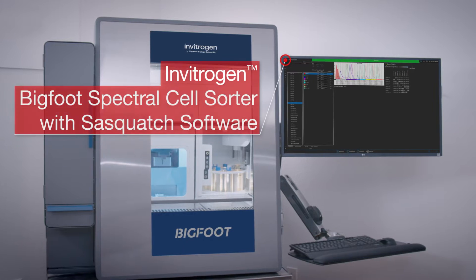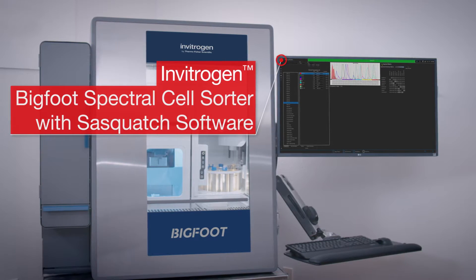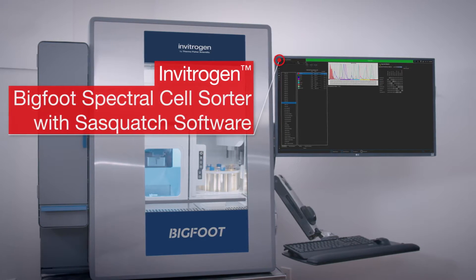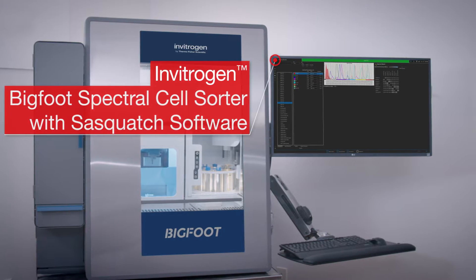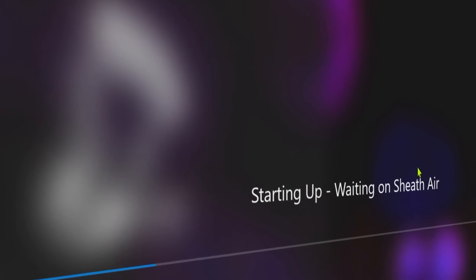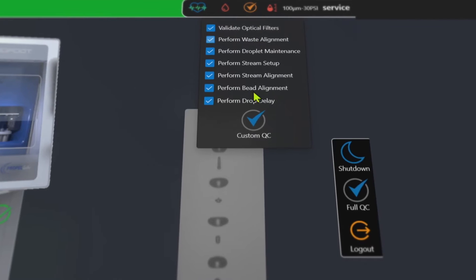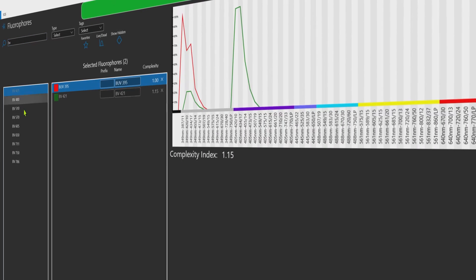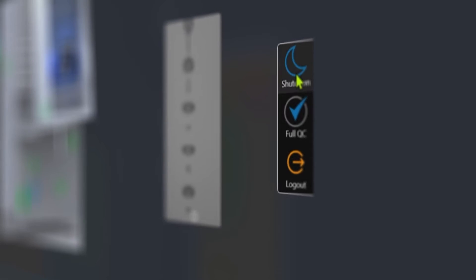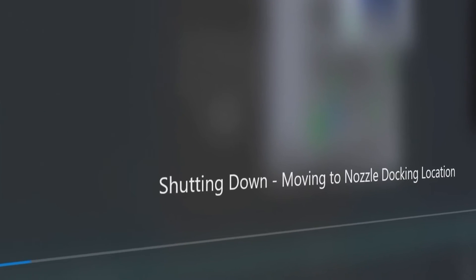Advanced automation and intuitive software allow operators with all levels of knowledge to use the InvitraGen Bigfoot Spectral Cell Sorter with Sasquatch software with confidence. The InvitraGen Sasquatch software provides quick start-up, auto-calibration and accurate quality control, as well as an experiment designer and one-button shutdown, allowing the system to be easy to use while reducing downtime.